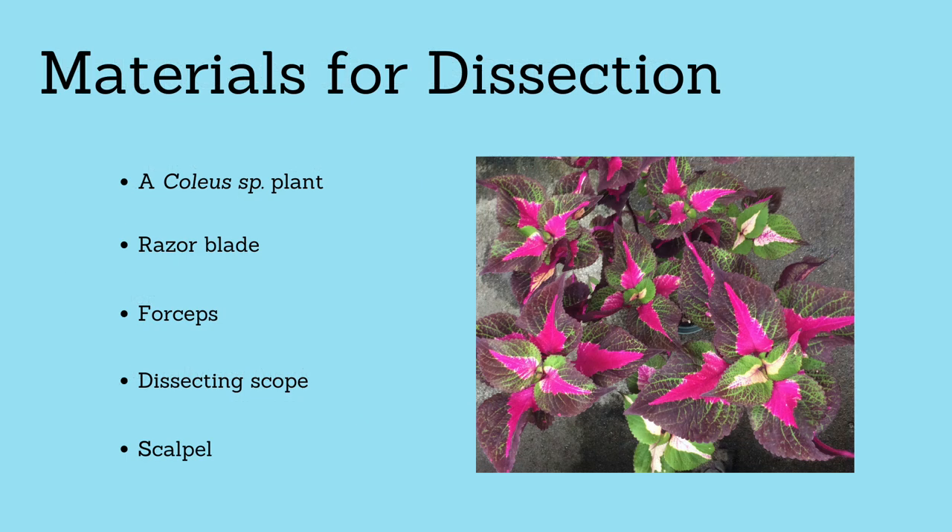The materials needed for this dissection include a coleus plant, a razor blade, forceps, a dissecting scope, and, although I do not use it in this video, some may prefer a scalpel to remove leaves.